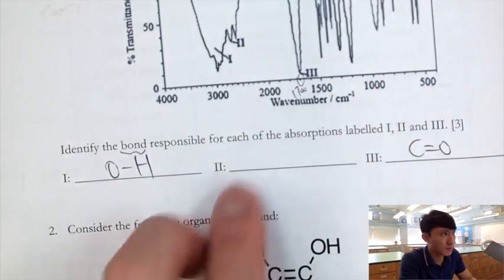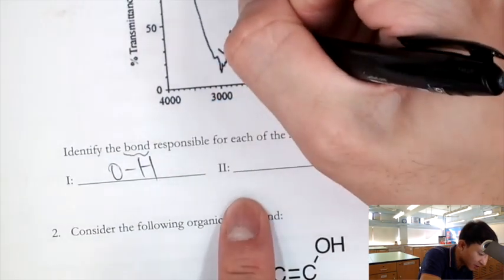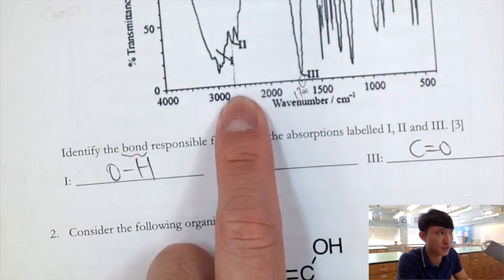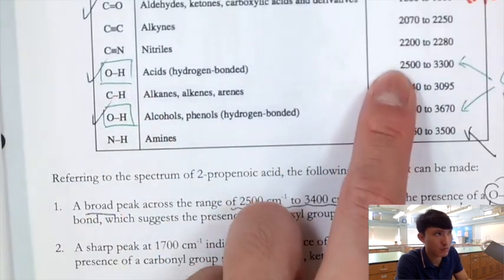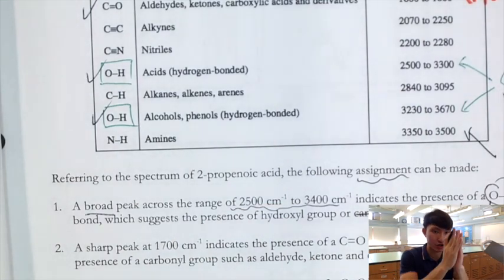Now, what about this particular sharp peak? Sharp peak at around 2,700. So you may flip over this table. You see, 2,700, we don't have it, right? Is it going to be the OH? Not the case, because for OH we have already indicated, and it should be a broad peak rather than a sharp peak.